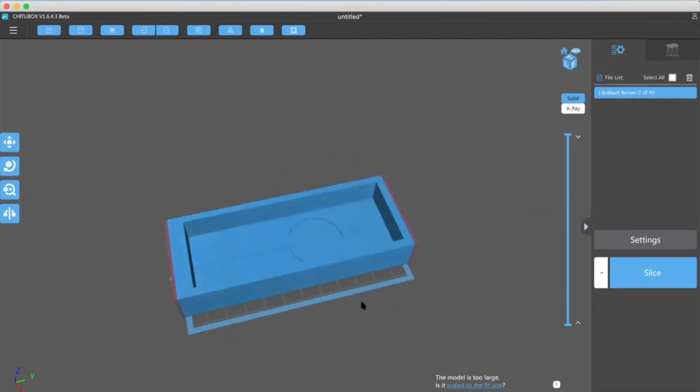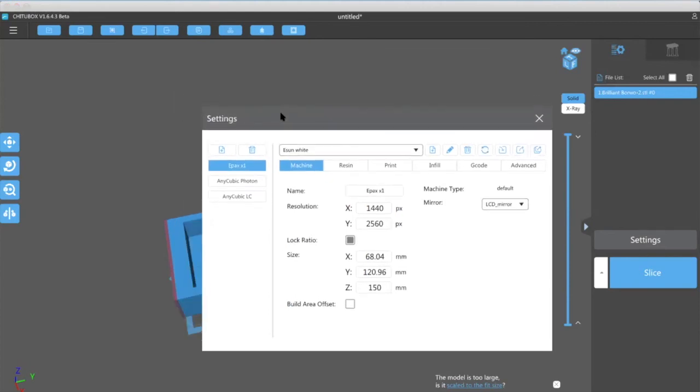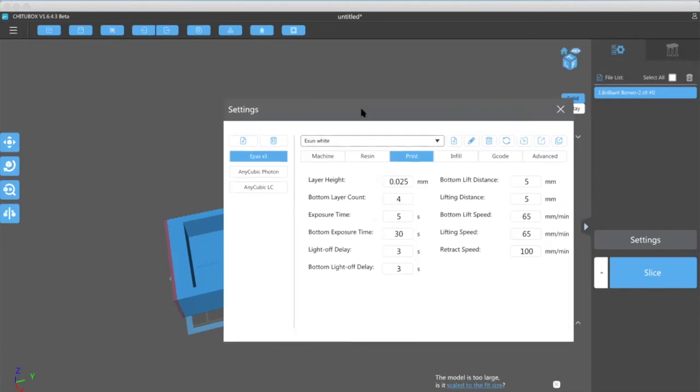So this is actually too big to be printed on this printer. But here is where things get complicated, because those are first of all kind of new printers, and second of all you can use a lot of different resins, and the resins are a huge problem, because you have an amount of light that they need, that you need to shine for photocuring it.